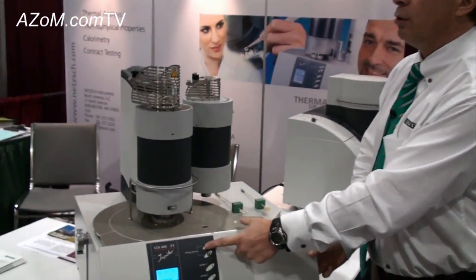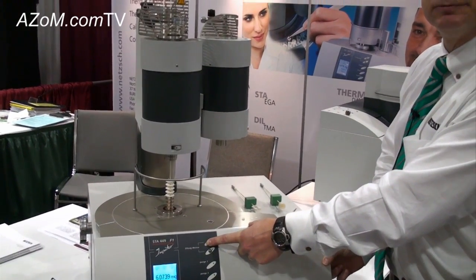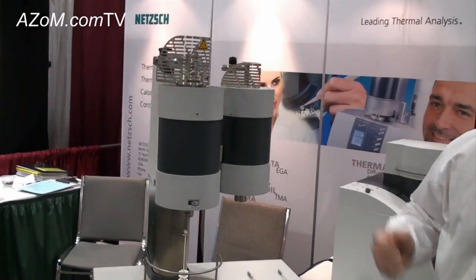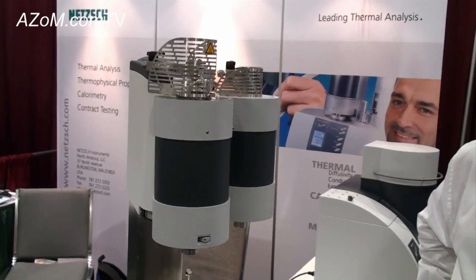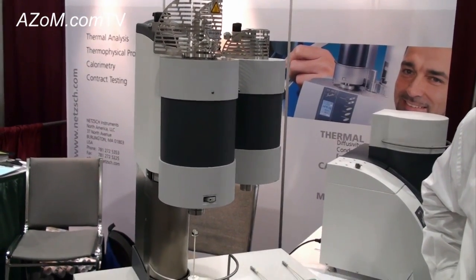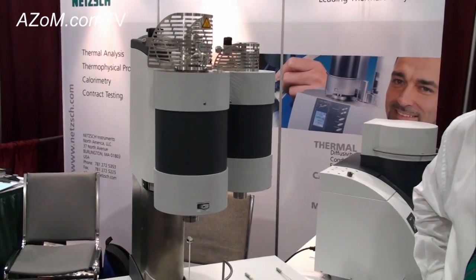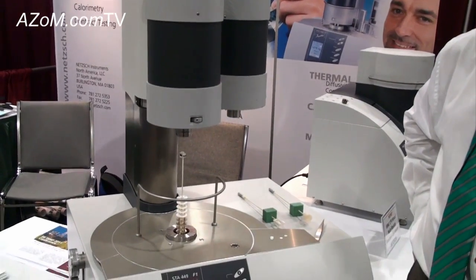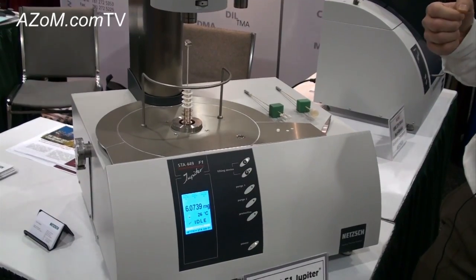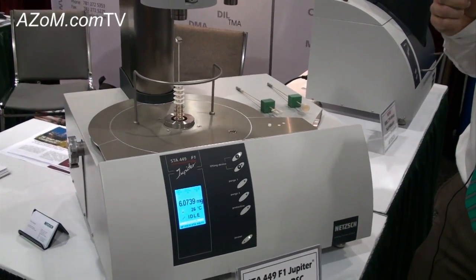We can operate over a wide range of temperatures depending on the furnace we use. The standard furnace is this silicon carbide furnace, which runs from room temperature up to 1,550 degrees Celsius. We have other furnaces that can go up to 2,000 or even 2,400 degrees C, and on the low-temperature range we can go down to minus 150 degrees C up to 1,000 degrees C, allowing DSC and TGA measurements in one run from minus 150 up to 1,000 degrees.